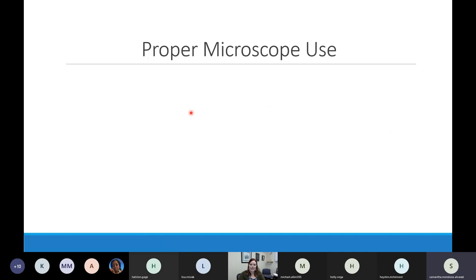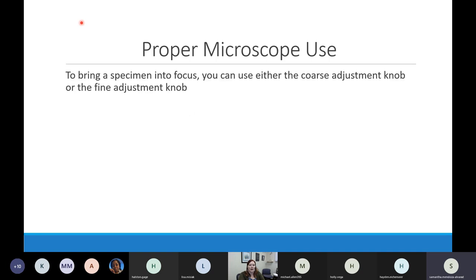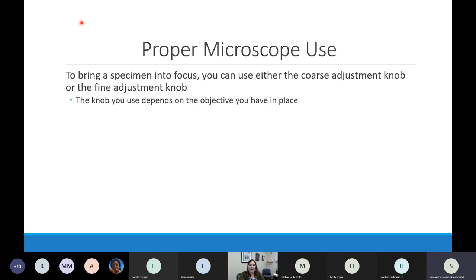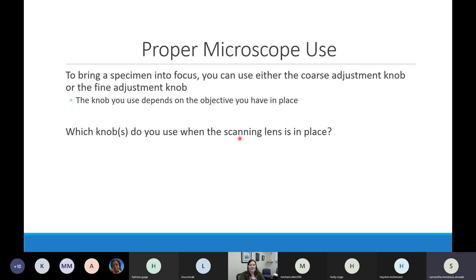Let's talk about how we use our microscopes. I'm going to walk you through a virtual microscope to show you a little about how microscopy works. When using a microscope to focus on what you're trying to see, we use both the coarse adjustment knob and the fine adjustment knob, but we use them at different times. Which one you get to use comes down to which of the objectives you have pointing down.